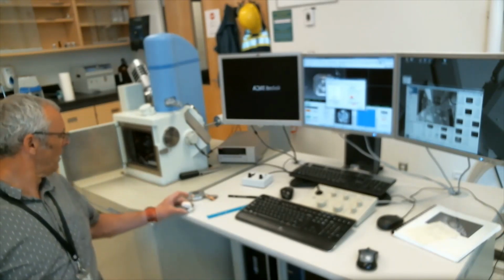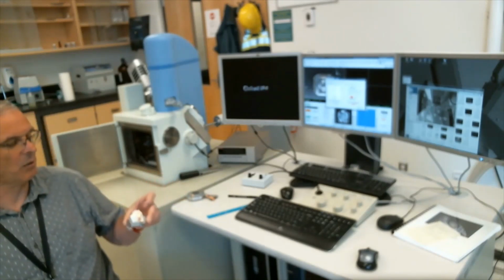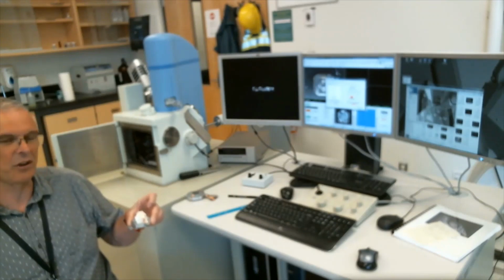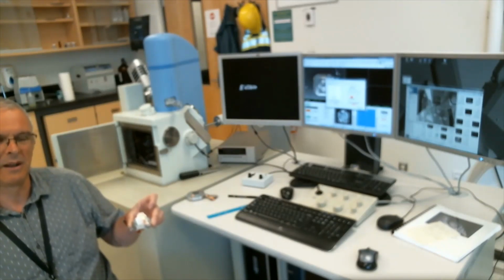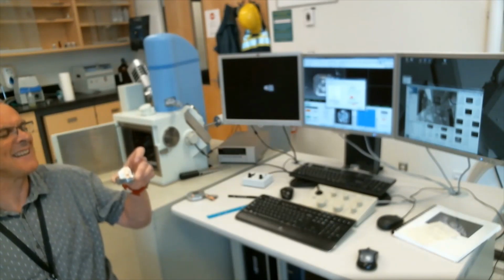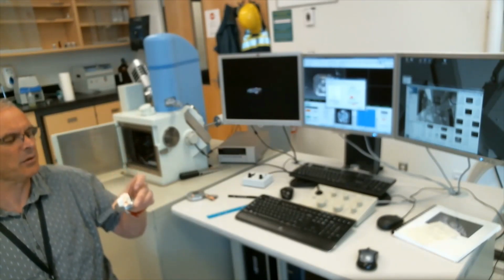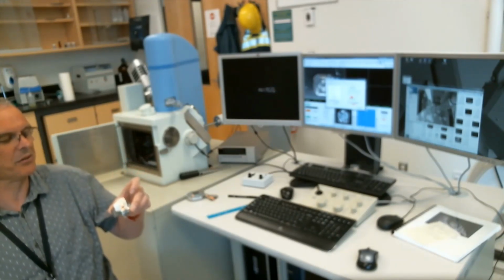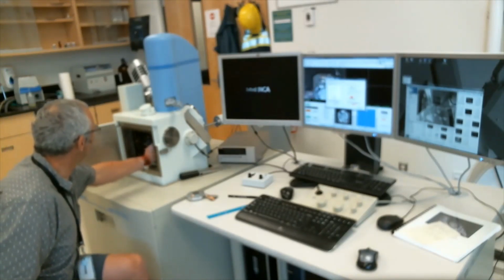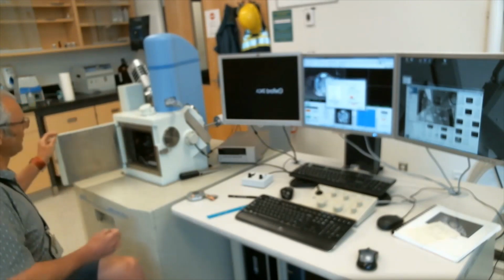Okay, so it's still a bit of live work. I'm not sure how much you'll see of this, but this is a piece of a feldspar crystal from a pegmatite pocket in Takeo in Cambodia, where Paul and I and some of our colleagues were working in February. And you can't see it in the camera, but on the surface, it's got a really fine late growth of feldspar crystals growing on it. Nice white crystals. So we'll put that in the machine. And I'll close the door.